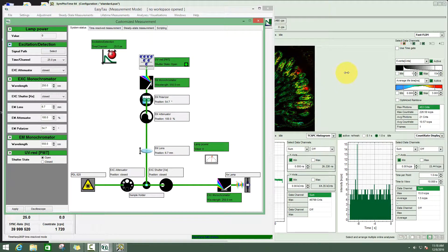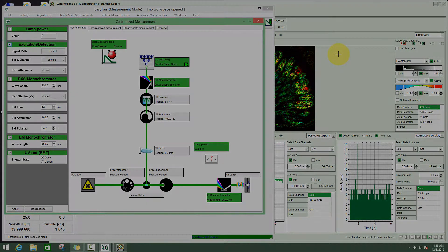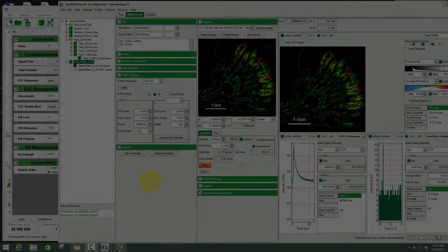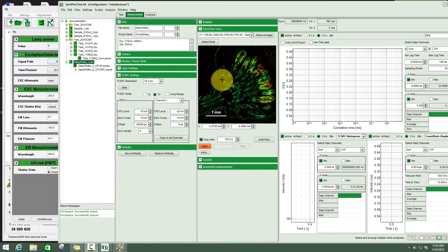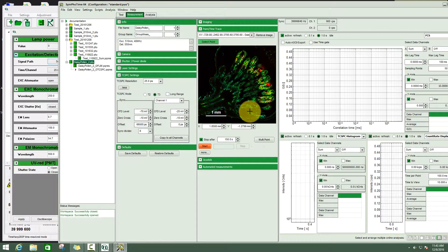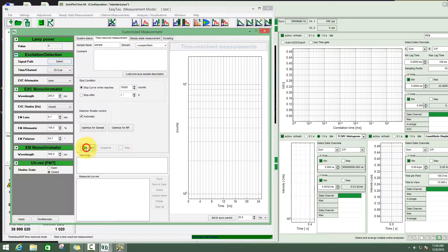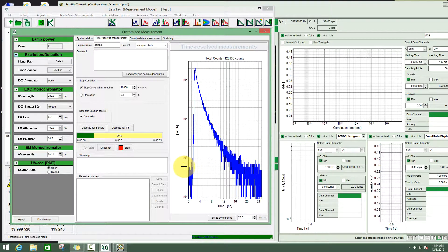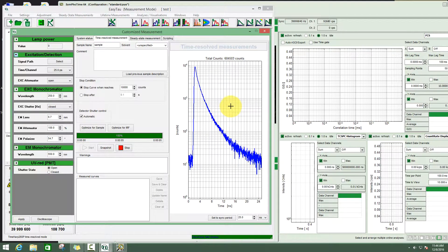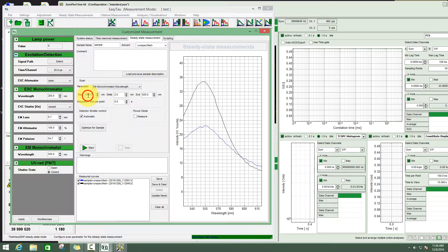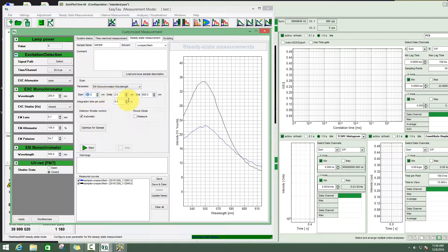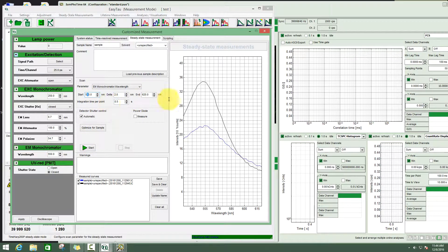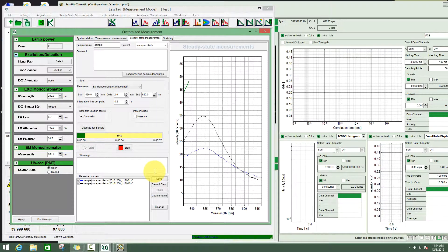Or we could go to a certain position and try to record some kind of spectrum here. For the second possibility we can define a point here in the image and use the functionality of the EasyTau software to acquire a lifetime curve at this position. Or you could combine it with a trace image or you could take a steady state spectrum. For example, here we could scan from 530 to 620 nanometers and record an emission spectrum at that position.